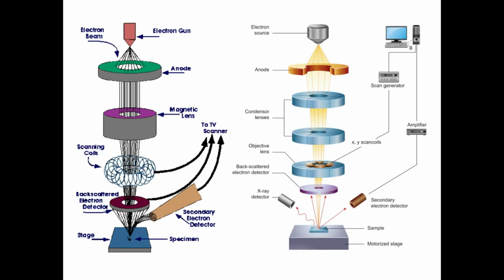Then we have the detectors. Detectors are very important. Various types of detectors are available in this SEM, but most probably we are using a solid state detector, which is coated with aluminum. Not a big matter.